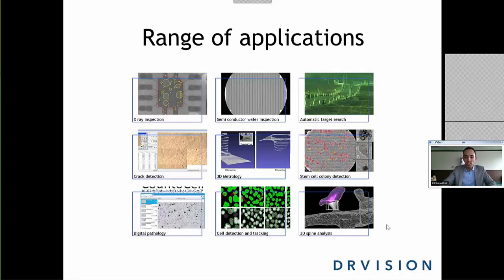For biologists, which is, I think, most of you, including myself and Quinn, apart from Bryce, who I think is the only one that does not know biology, the only pictures that will be somehow recognizable are the ones perhaps on the bottom right. All the other ones are not really biology related.